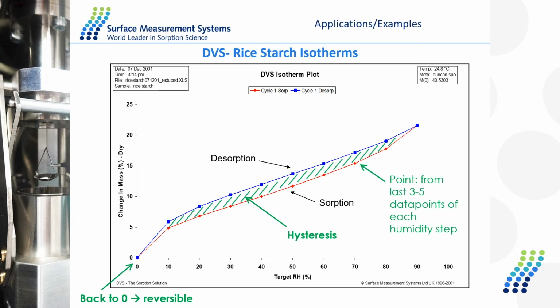Now, thinking about bulk sorption, we always think about thermodynamic equilibrium. This is a significant gap of hysteresis, and this experiment was performed at 25 degrees C. The desorption process, specifically in bulk, is usually determined by the amount of energy provided to the system.